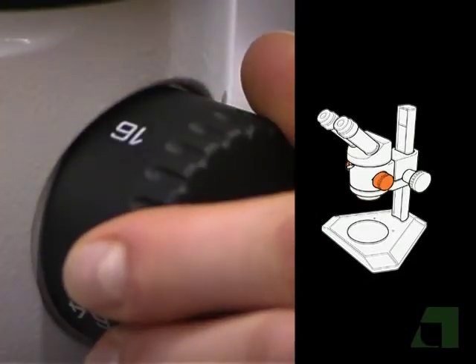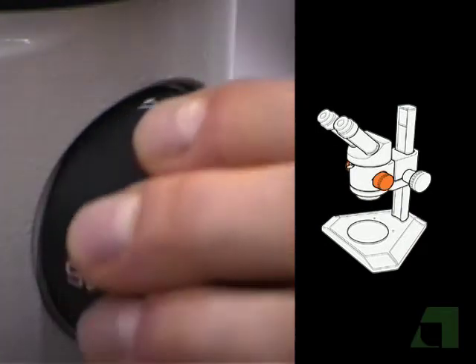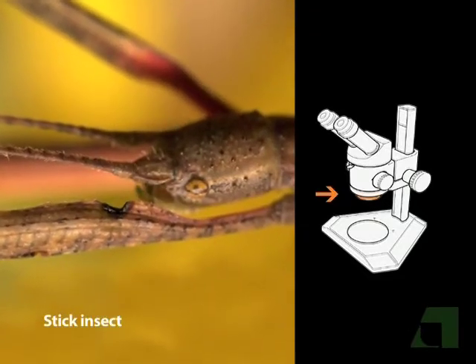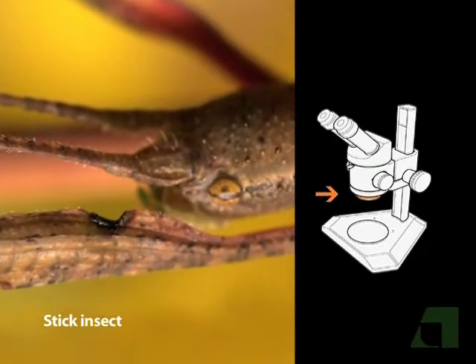Changes in magnification are usually done in discrete steps by using different objective lenses. The lenses are often located in a sliding or a revolving nosepiece. Some microscopes have objective lenses with a cam mechanism that allows continuously variable or zoom magnification.